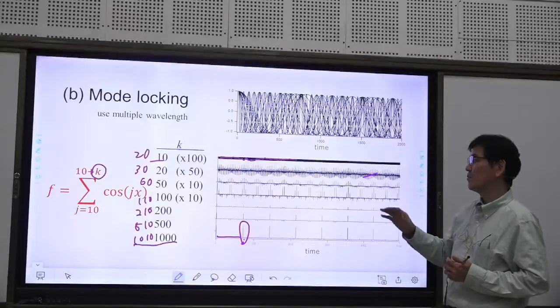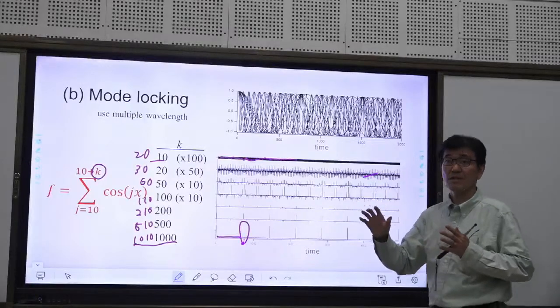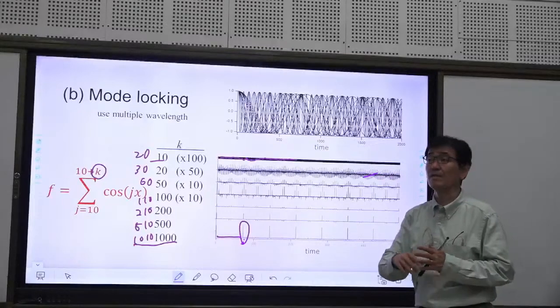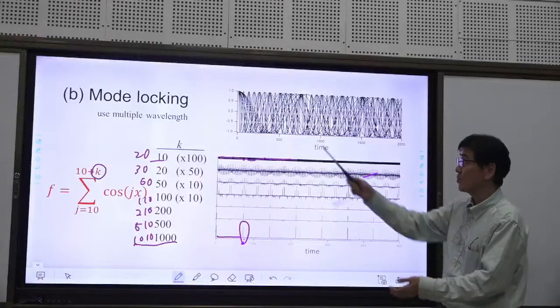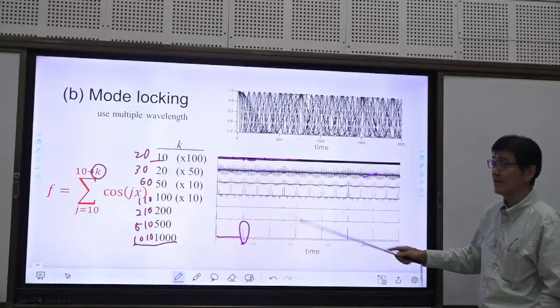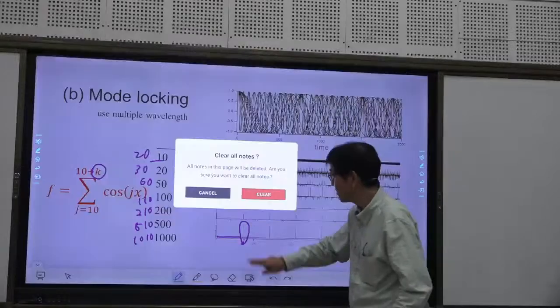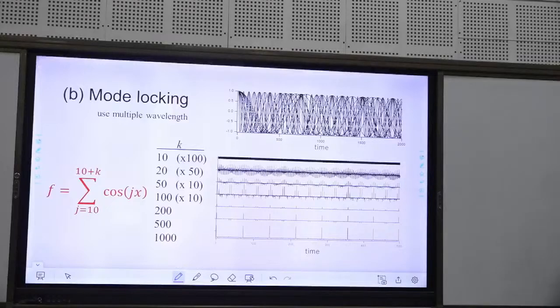Maintenance is much easier than the other systems as a pulse laser. Q-switch laser is sometimes unstable and sometimes, due to a power cut or something, the system shuts down. So trouble sometimes occurs. But mode locked pulse laser owes its performance to the laser rod, so it's always stable. So that's why the mode locking pulse laser is widely used nowadays.